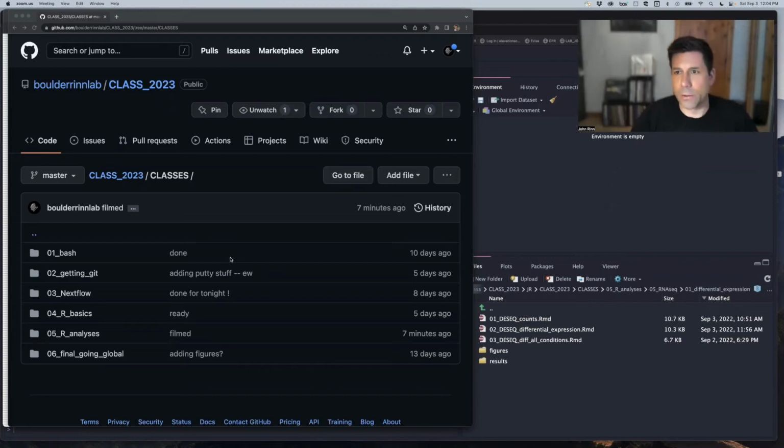Welcome everybody to our class on DESeq, where we are going to do multiple comparisons. In the last class, we just compared condition A and condition B. Today we're going to do something that's more common, where you want to compare a bunch of samples back to one condition. And then how do you deal with all those results? When you're making all those comparisons, how do you extract them?